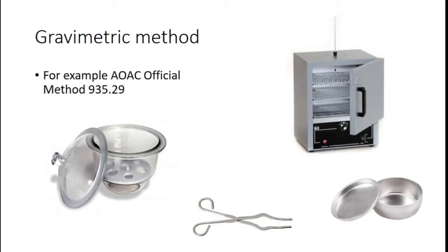The method that's most commonly used for measuring moisture content is what's called a gravimetric method. In essence, we're measuring the mass of that product before and after heating to see how much material is volatilized off. And we've talked about this before, that there are standardized methods in many cases. Moisture content does have standard methods, and some governments have standardized methods.